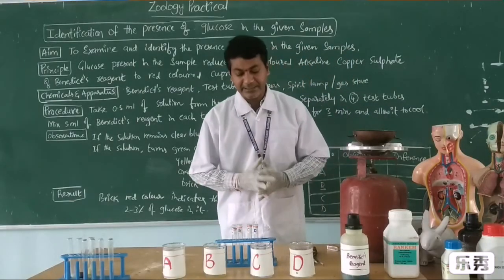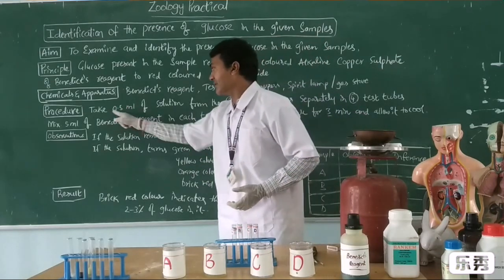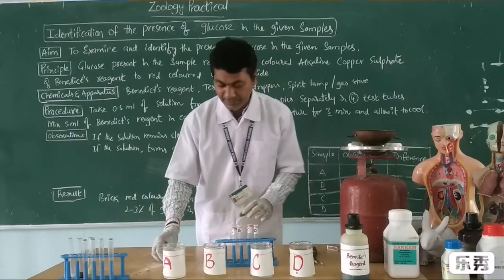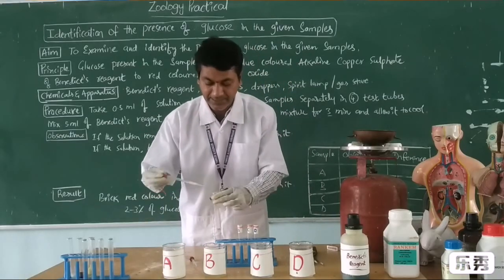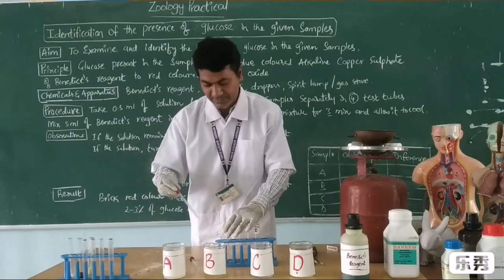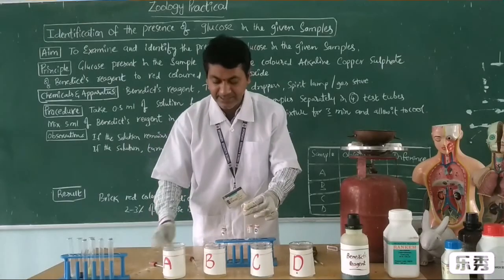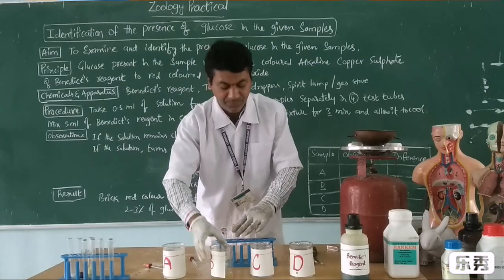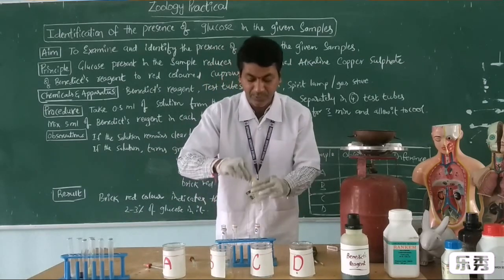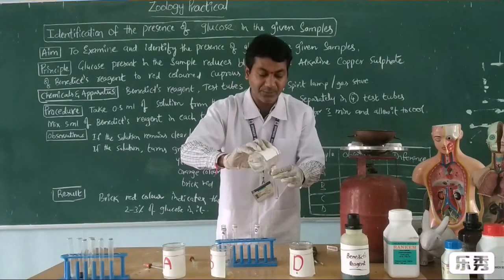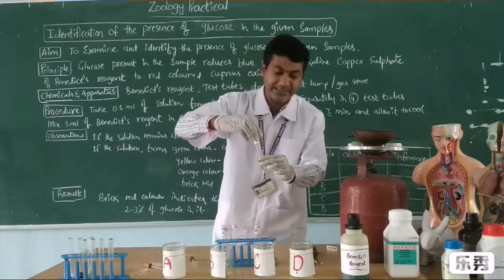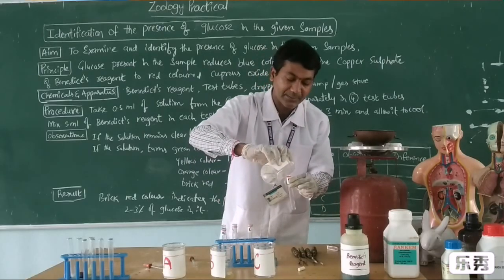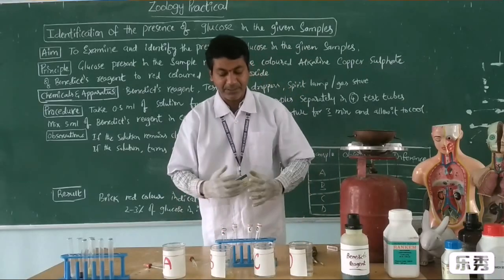Alright, now let us start the procedure. Take 0.5 ml of solution from the four test tube samples separately into each test tube. I am taking sample A into test tube A. Now sample B. I am taking directly instead of using droppers as it will save time. Meanwhile, I have started the stove so the water is heating and boiling. Taking test tube C and test tube D, I have drained all four samples into their respective test tubes separately.